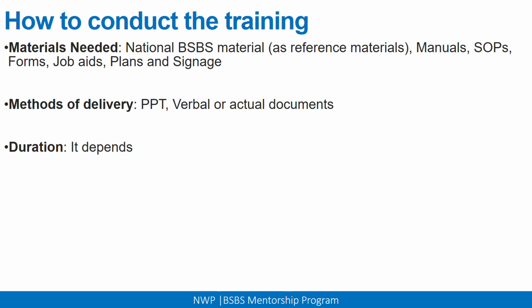Yeah, so for the training where you want to do a training using the 17 modules from the biosafety, biosecurity training program, of course, you need to mold them in such a way that they speak to what you're doing in the facility and not just use the actual modules to deliver your message.